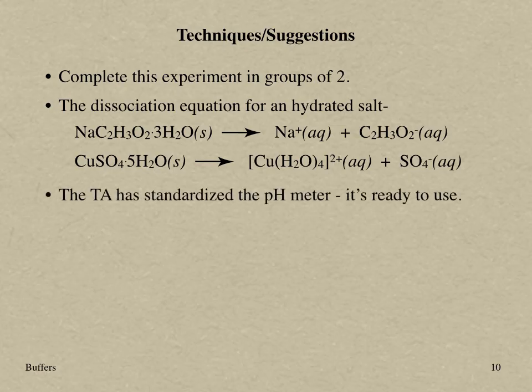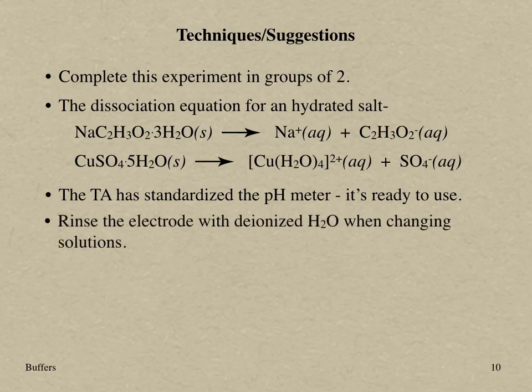The TA has already calibrated the pH meters, so they are ready to be used. Make sure to rinse the electrode with deionized water when changing solutions. Unless rinsed, small amounts of one test solution can be transferred to another, contaminating it and affecting the measured pH.